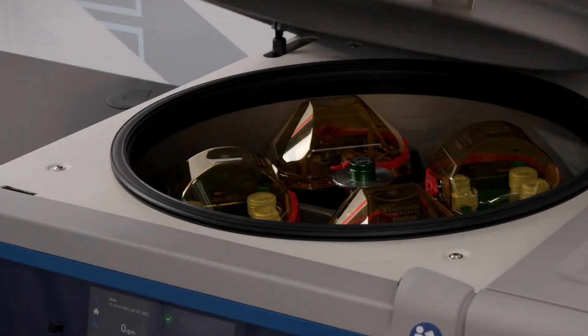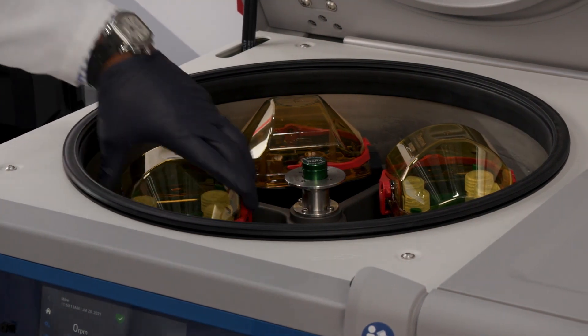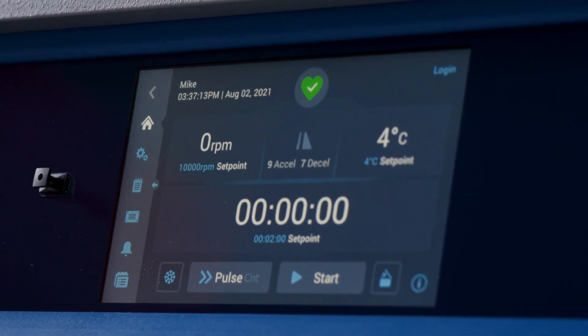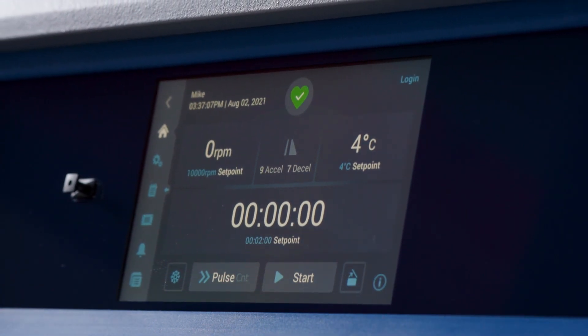The Thermo Scientific X-Pro centrifuge touchscreen interface delivers a higher level of security and reproducibility to your research, run after run, in an easy-to-use format. These are just a few of the features the X-Pro offers. More videos highlighting the safety and versatility features are coming soon.